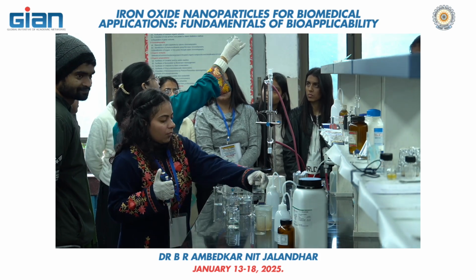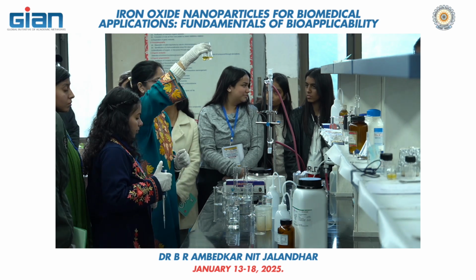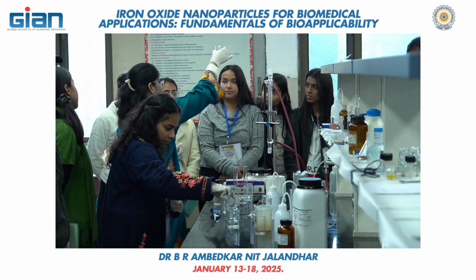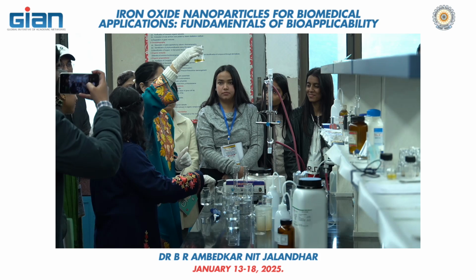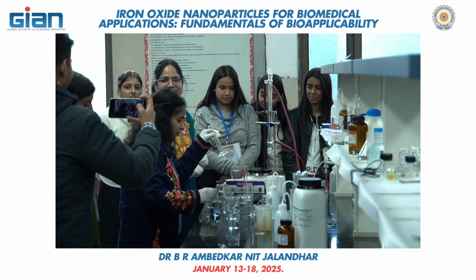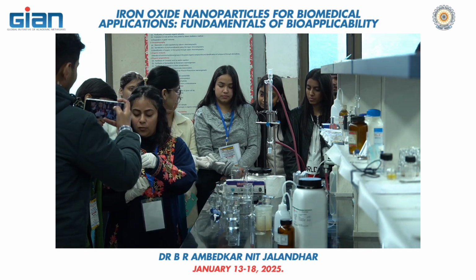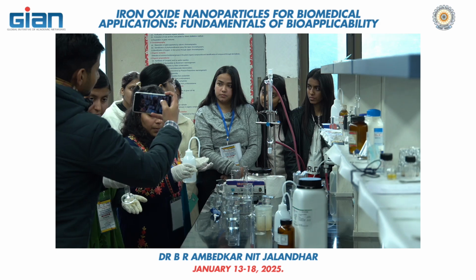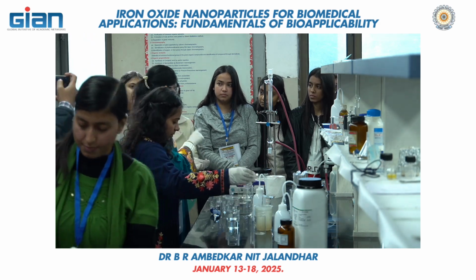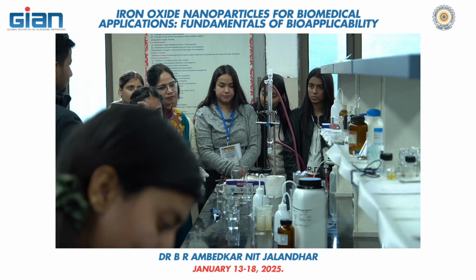Nanoparticles are a very simple technique, right? So now they are formed. Silver is not always silver. Now we will have the second one, the gold nanoparticles. After this we will conduct the UV spectroscopy, and I will show you the images of the absorption that we will do.